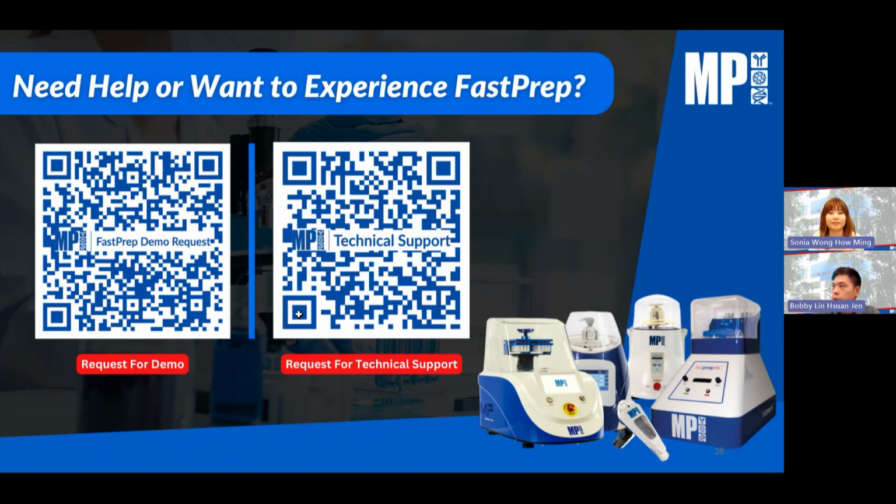I think also sometimes when you receive plant samples, they come in larger size, right? So sometimes nitrogen freezing it and breaking them down in smaller pieces before you actually homogenize them is also very important in this case. So again, just like we mentioned in the case studies, plant samples have a very fibrous nature and also they are tough in their cell wall. So whatever Dr. Sonia just mentioned is something that we can take into consideration. So I hope that addresses your question.